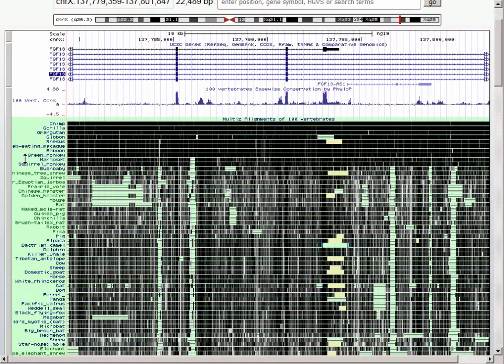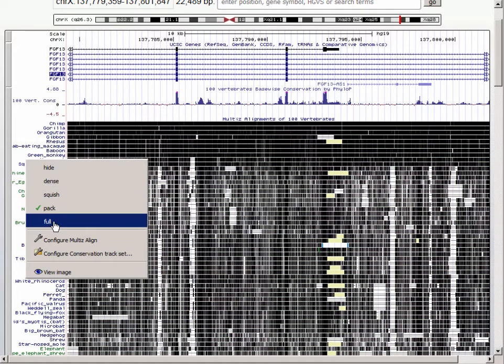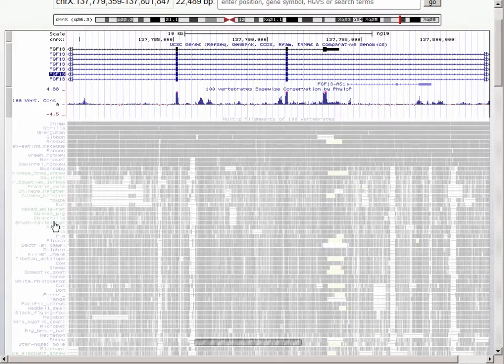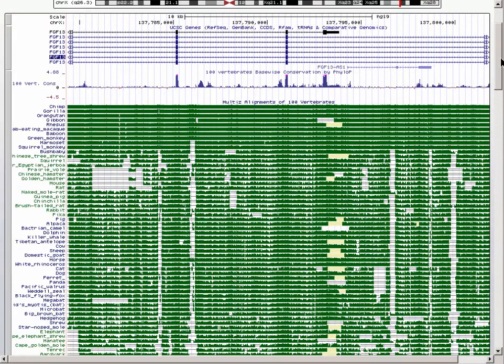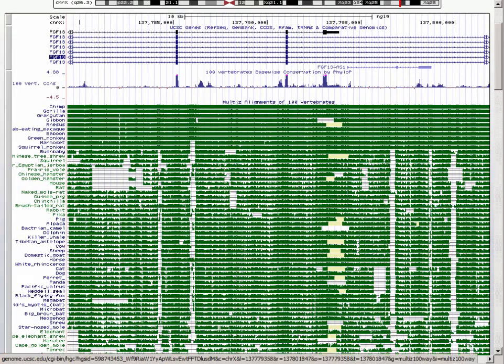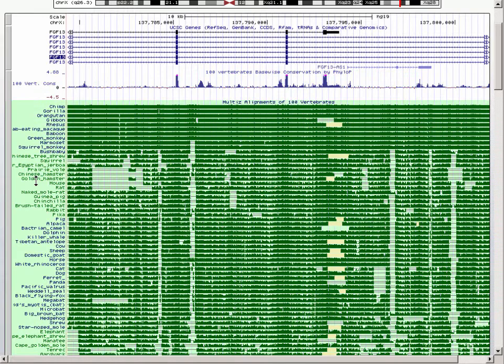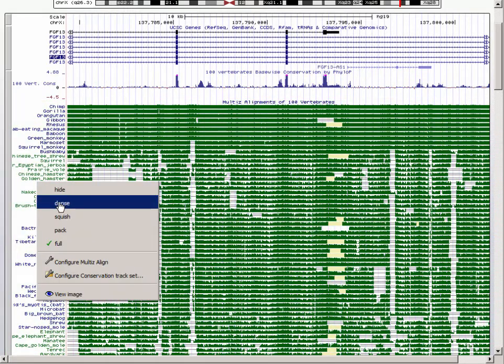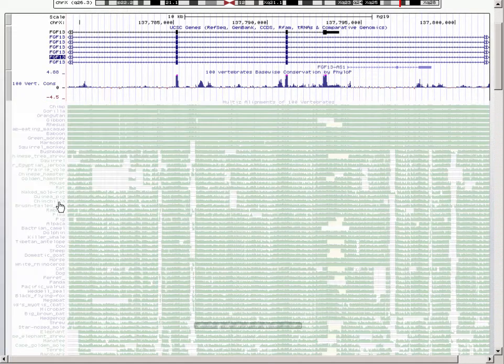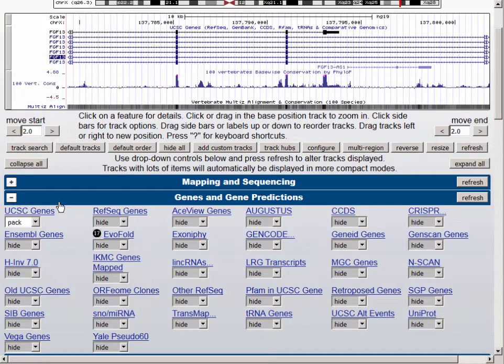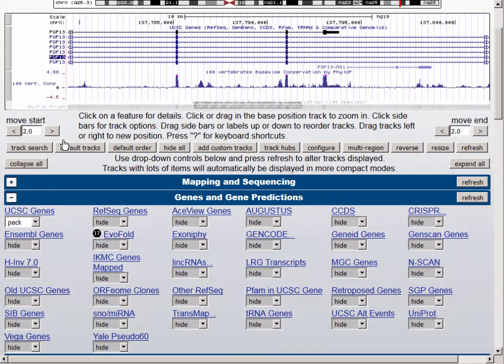Let's take a look at what the multi-z track looks like when changed from pack to full. You can see that instead of just a coverage track, you now actually have individual graphic wiggle-type tracks that show for each species the sequence conservation score. The other two modes — dense and squish — are not too useful in the multi-z, as they simply squeeze all of the tracks down into a much smaller space and you lose all resolution with respect to the 100 species.